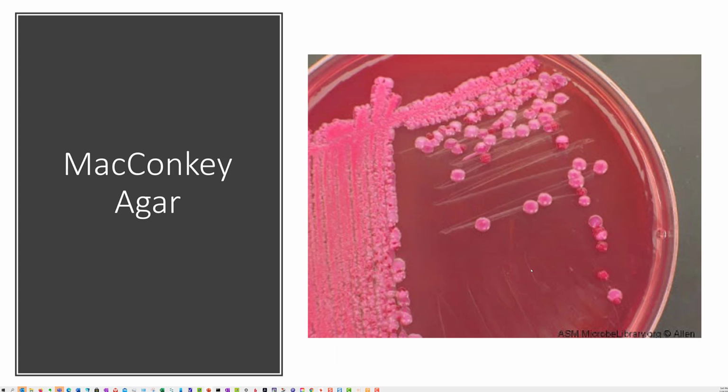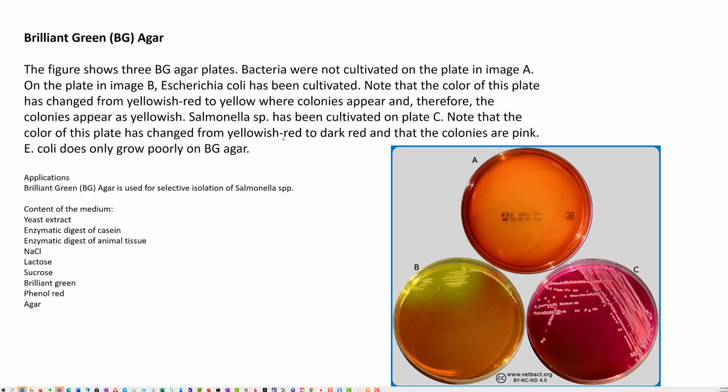So here's another MacConkey agar showing you dark red, and it's taking up two dyes for this particular organism. It has something in the membrane that's binding it, but it still looks like it's doing a fair job of fermenting, but something else is going on with it. I always like to show some of the weird stuff that goes on from time to time. Some kind of mobile genetic element or something, I'm not sure.